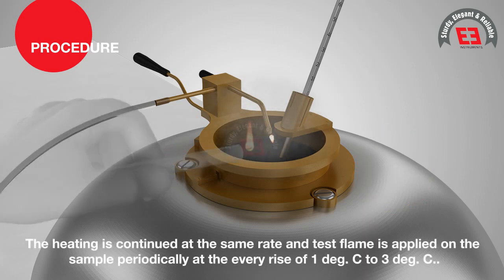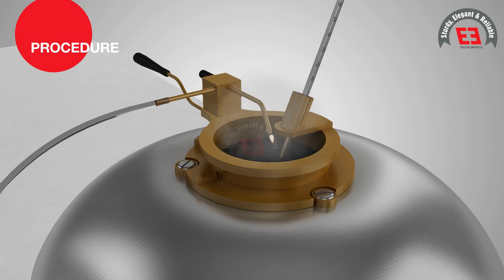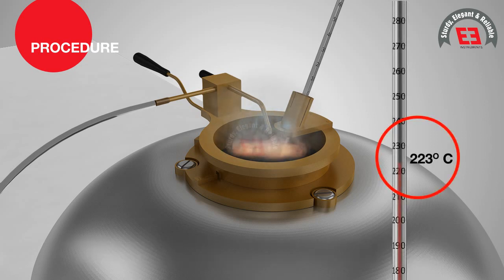The heating is continued at the same rate and test flame is applied on the sample periodically at every rise of 1 to 3 degrees Celsius. When binder itself gets ignited and continues to burn for 5 seconds, the temperature at that instance is noted and recorded as the fire point.